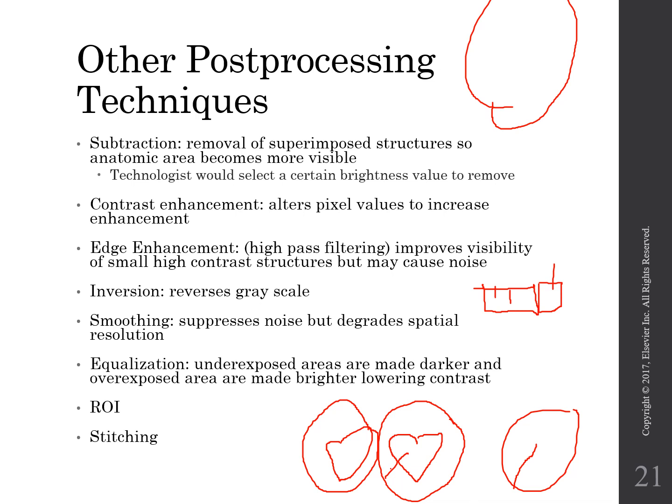Well, if I turned on smoothing, my system would see this and recognize that there probably shouldn't have been no intensity there. It was that I used too little mass and it didn't get the intensity. So it'll go ahead and average the surrounding pixels and assign it a pixel density value. In that way, it fills in the gaps, but with doing that, you lose some of the accuracy or the spatial resolution.